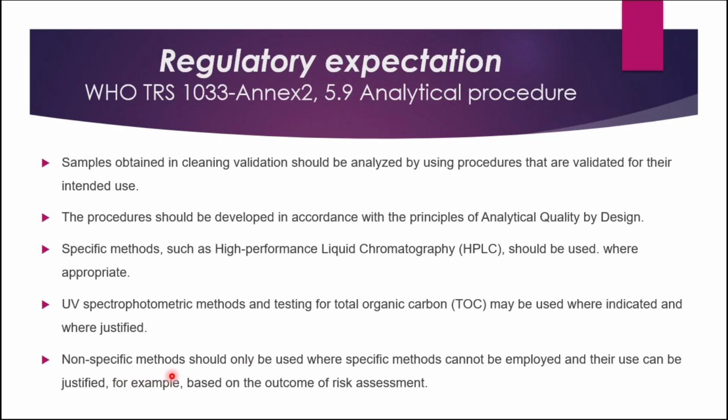Non-specific methods that we talked about, pH, conductivity, even titration can be used only if justified and other methods are not available or other methods cannot be implemented. Where specific methods cannot be employed and their use can be justified. For example, based on the outcome of risk assessment. If risk assessment shows that there is no risk in using this method, then you can use a non-specific method also, right?